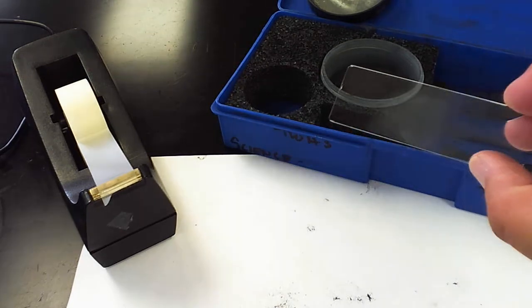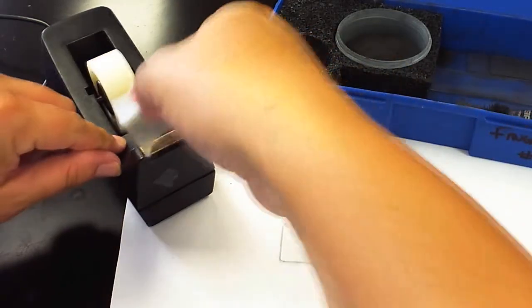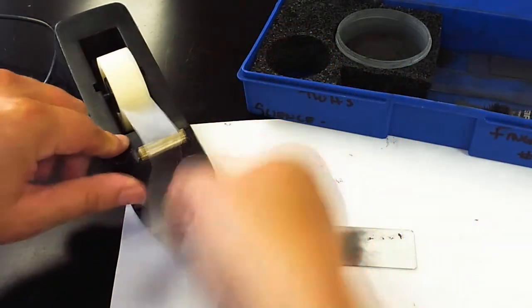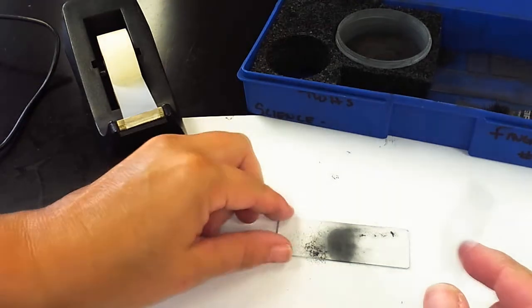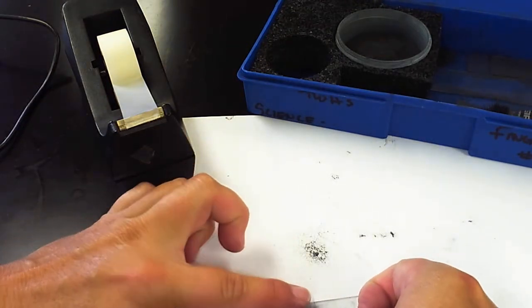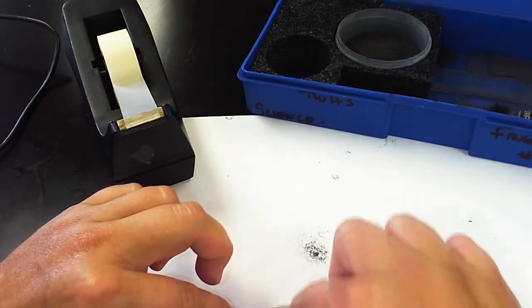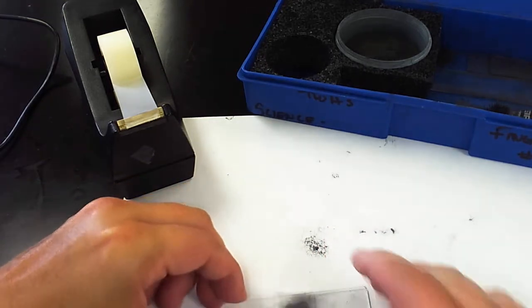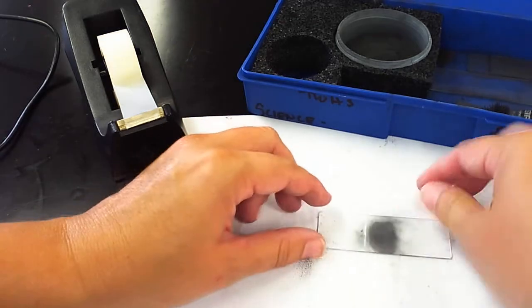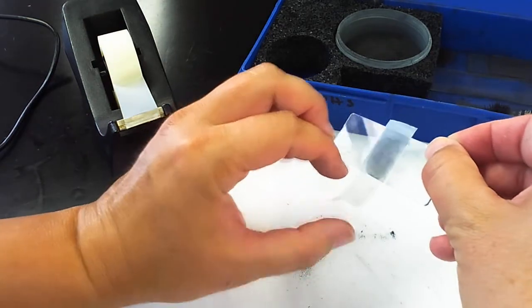So now that I have the powder on my fingerprint, what I'm going to do now is I'm going to use some tape to try to lift it. Again, this takes some practice. So I'm going to put the tape very carefully over top of my fingerprint, and I'm going to try to make sure I get all of the air bubbles. I'm going to make sure I get all of the air bubbles out by kind of rubbing it back and forth on top of the tape.